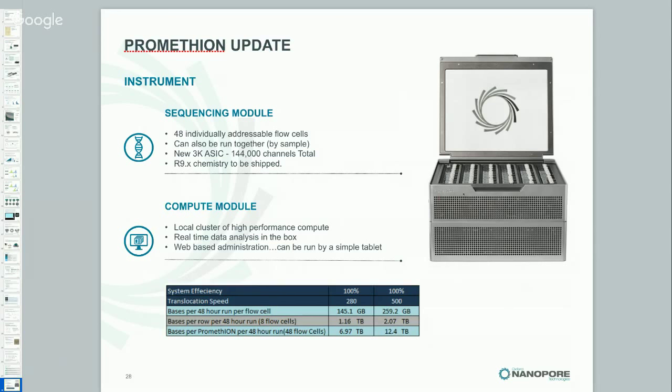certainly once we fix that little shortfall on the throughput over time, the numbers should climb very quickly. You can sort of think about that a bit like, for those who remember, optimizing cluster density on Solexa Illumina. We have to optimize this yield over time issue to get the maximum out of the system. But even in the worst case, it is a shed load of data from a relatively low cost box.